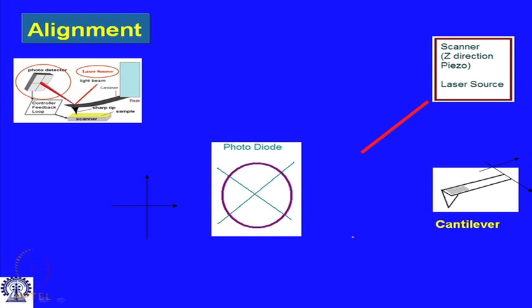We had also talked about the sequence of alignment. These are the hardware elements you have. You have the cantilever and the probe sitting over here, which has this reflecting surface, which can be seen from this particular shining silver area. You have two sets of screws for movement in the x and y directions respectively.